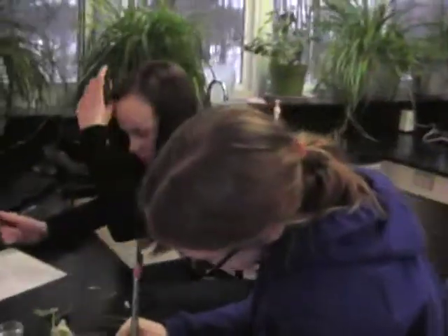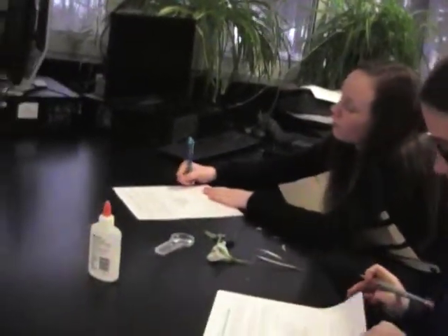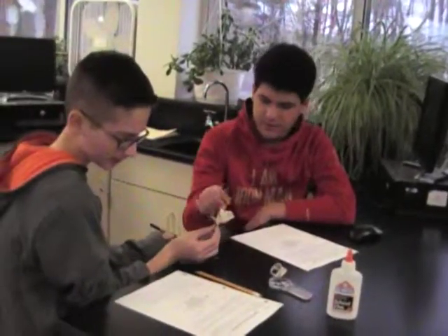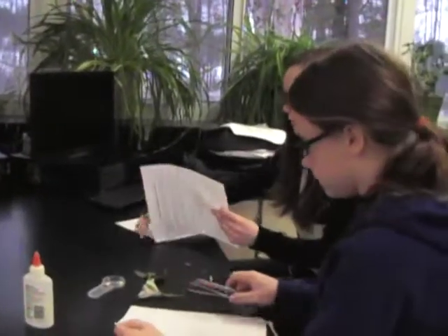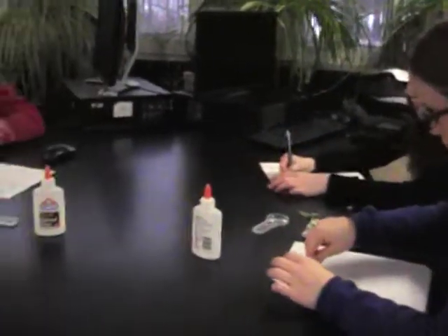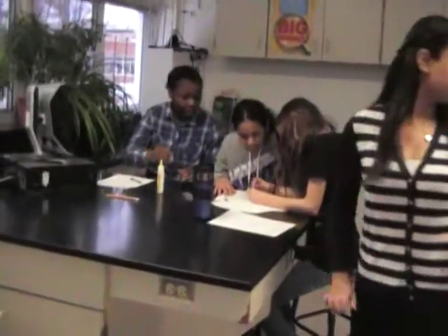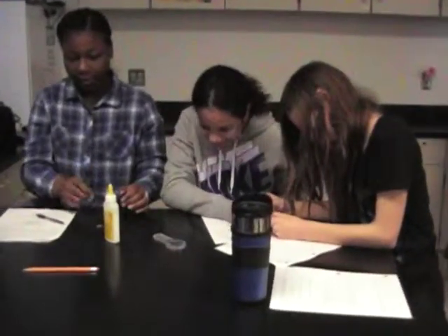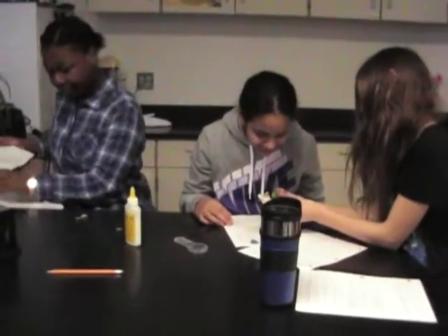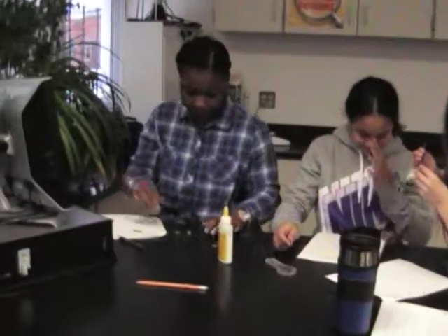Okay, they're identified. We can't find a sepal like this. This is the bud of the new flower, baby flower, and the green things outside of it. Very good, Lauren. Do I have to glue it? Does this count as a sepal if you have a baby bud? Yes. Alright, I'm going to do the next section.